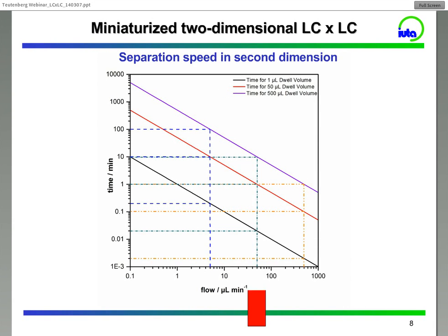If I now adjust a flow rate of about, let's say, 50 microliters per minute, which is very typical for our kind of application, and I use one of the best UHPLC systems, I have a gradient delay time of about 1 minute. So this is too slow for our kind of application.